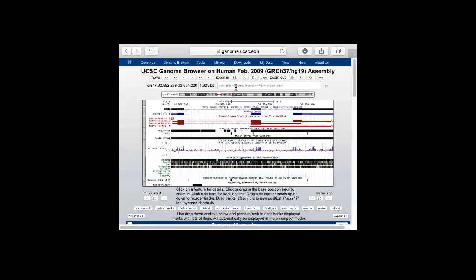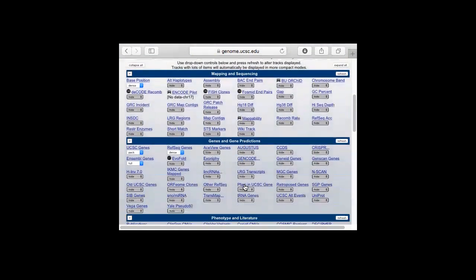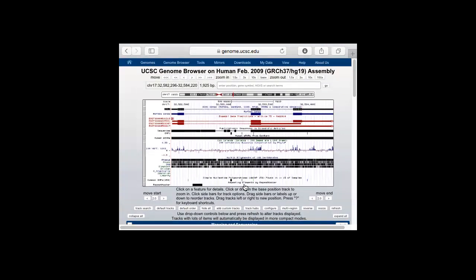One thing you can see is that this is one particular gene and where the exons are, introns are, and things like that. But you can go back and see there are many different databases, and if you turn something on, it will tell you where the gene is, and there are many different annotations. But if you look at this, there are several different buttons at the bottom.